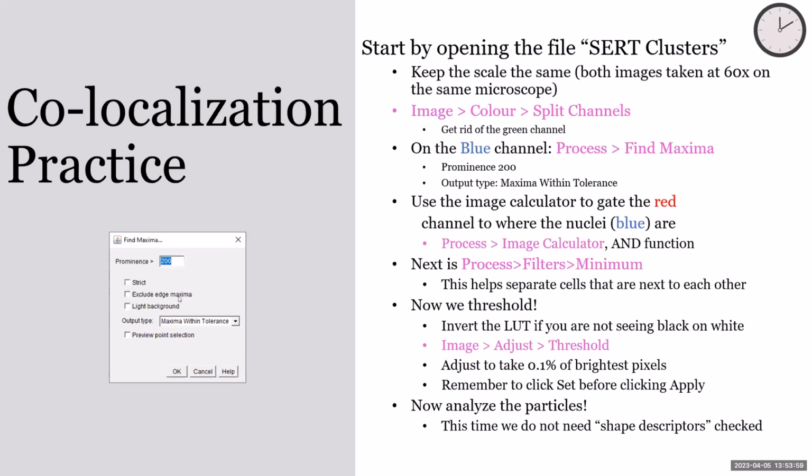I would also recommend everyone download the files that you'll need for part 3. They are just called the ImageJ_examples. You can just download that as a zip folder and extract it somewhere that you can find it easily.